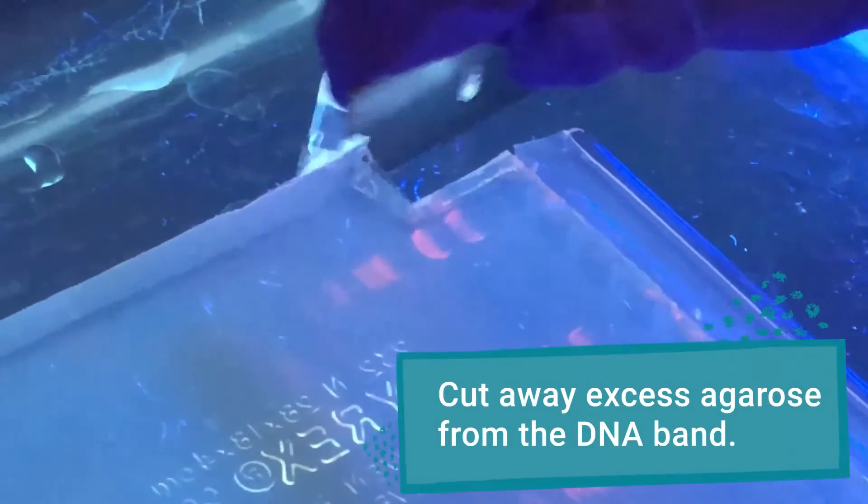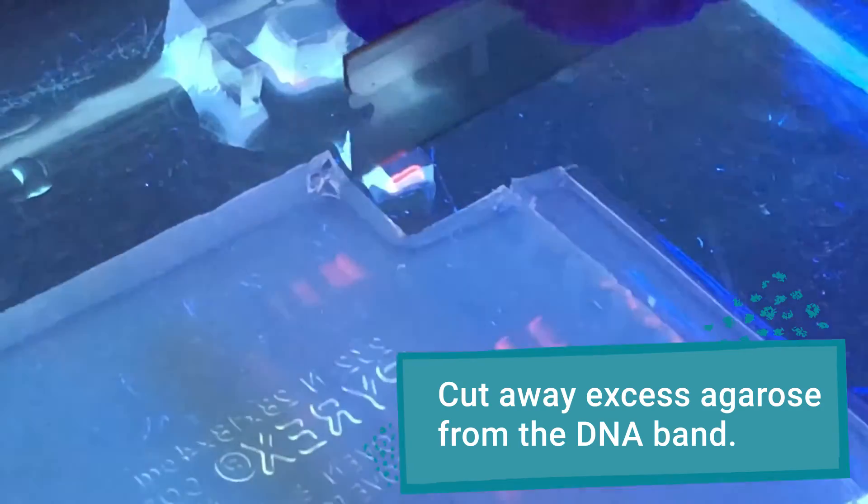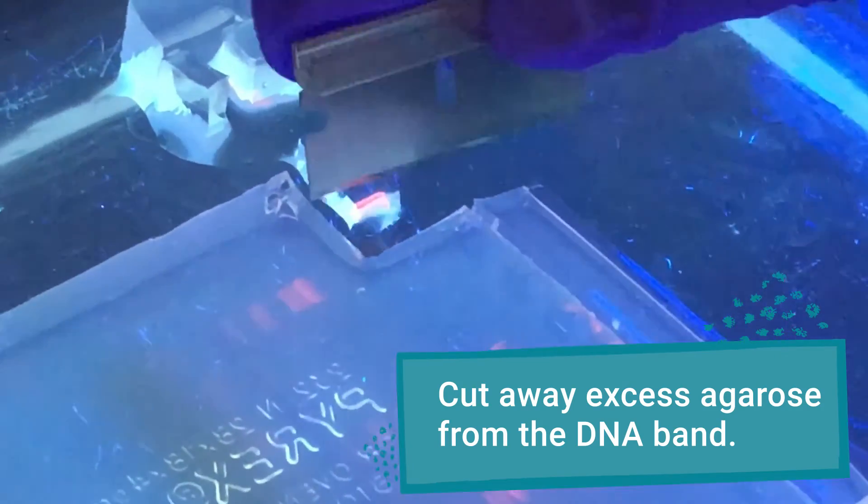Quickly and precisely insert your blade into the gel and cut around the band of interest. Try to include as little of the surrounding agarose as possible. Transfer the gel and band to a fresh tube.